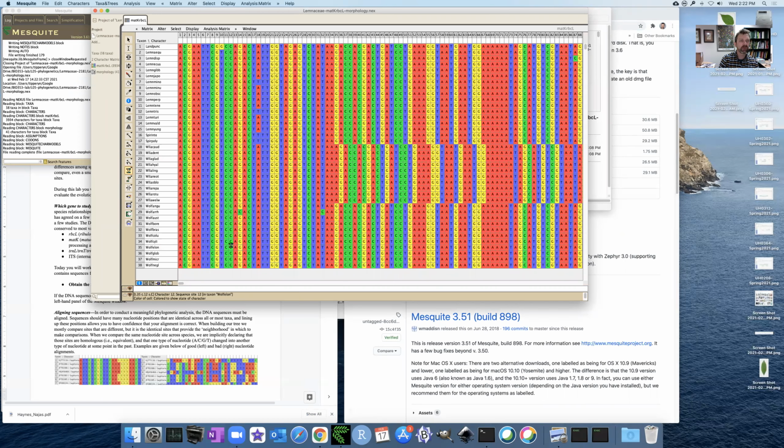And what I've got here is a set of species abbreviated, so it's 4 letters for the genus and 4 letters for the epithet. So land punk is Landoltia punctata. And you can see I've kind of curated this so it's a little bit crisper. But you can see that we have sequences that line up very well in the beginning, and then something goes wacky, right? So something is different here about these sequences, this block of sequences relative to the other sequences.